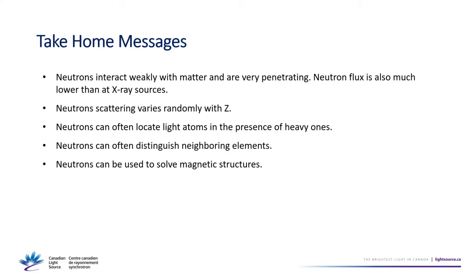So in terms of costs, how do the neutron and X-ray synchrotron spallation sources compare? Yeah, so in general, neutrons are more expensive. I think probably a little bit of that has to do with building the facilities, but a lot of it is just that you can't crank through as many samples with neutrons because the flux is lower. With the synchrotron, we can do many samples in an hour. With powder diffraction, you can just crank right through them. With neutrons, you can't go through them as much.